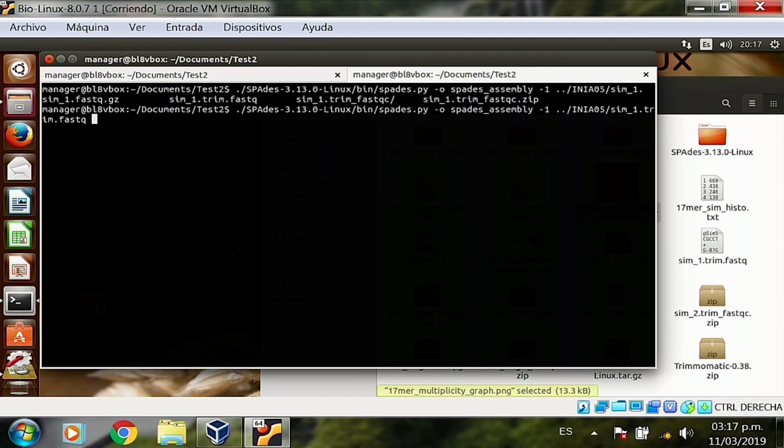Do not press enter. By the way, do not press enter yet. We're just filling in the command. The command is much larger than this one. If you press enter right now, you probably get something running, but it's probably going to be an error. All right. So this command is not complete. So don't press enter yet.